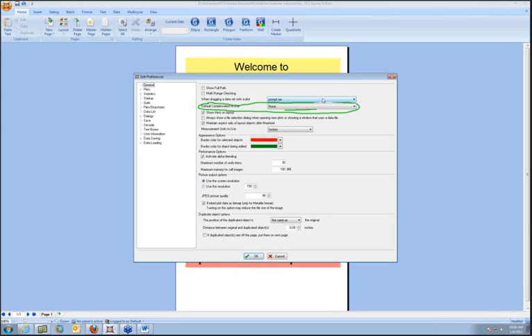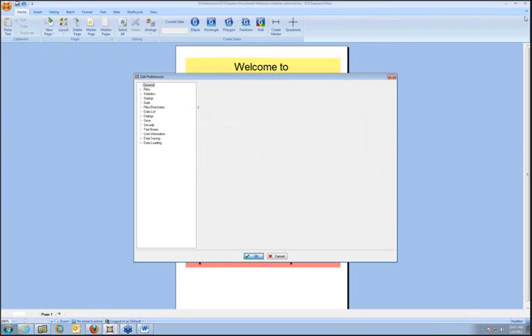Otherwise, as soon as you open a new data file, it won't use what you set up in the layout, it will use what's associated with the FCS file. And again, you could use only the compensation default or use the FCS file by itself, without checking the compensation default afterwards. This is an option that most people just leave on the default, but I just wanted you to know that it's there. Okay, and I'll show that working in a moment.